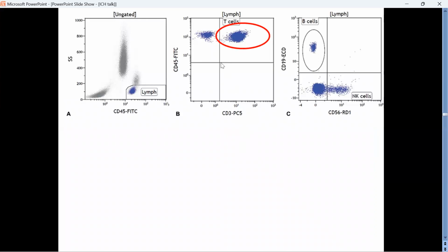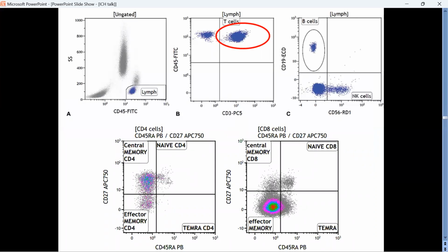Okay. Now, the flow phenotype of this particular child is you find the T cells to be there. Okay. And you can also find a small population or a decreased number of B cells, CD19 positive lymphocytes, that is the B cells. So you find the T cells and decreased B cells. But if you study the T cells further, you can find that most of these T cells are in a non-naive state. That is, it is either in the memory state or an activated state.